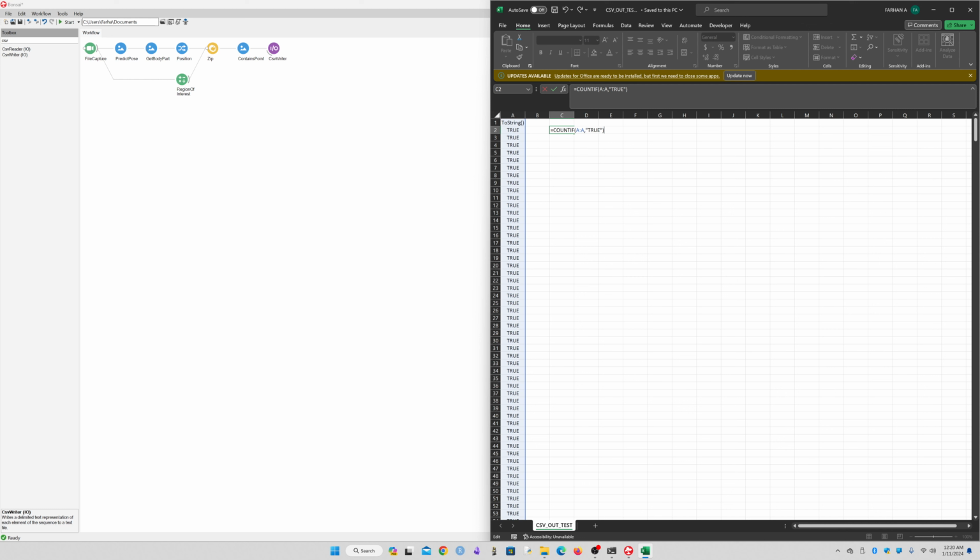And for example, if I want to understand how many frames the mouse has spent within that region, what I need to do is count how many true values there are. In this case there are 900 true values, and let me mark this as count of frames in ROI.